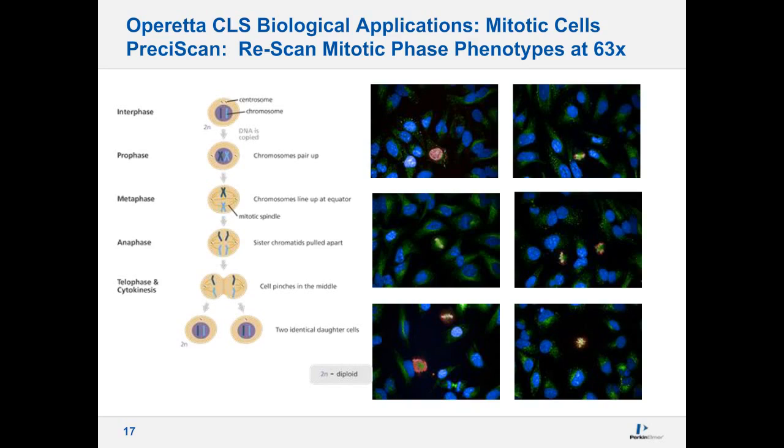from this particular plate. When we break down the mitotic phases, we can identify these based on phenotype. In interphase, we're talking about cycling cells, so these are cells that are in G0, G1, S phase, and perhaps G2. And then we can identify cells that are in prophase. These are phosphohistone H3 positive cells, in the early stages of mitosis, and they're identified by the red arrows as shown.